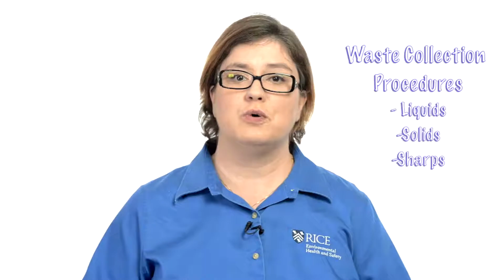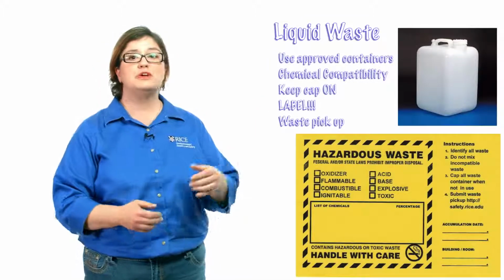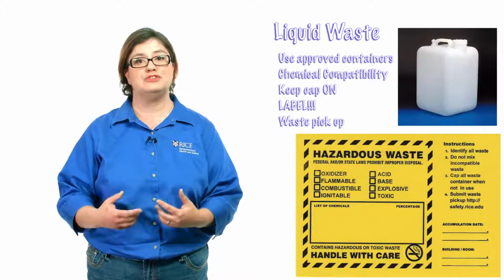So we're going to talk about what to do with liquid waste, solid waste, and sharps waste. You'll want to collect your liquid waste in a plastic jug called a carboy. You'll notice when you get your carboy from the stockroom that it has a yellow sticker on it. That's for you to tell us a little bit about the waste and how we need to treat it.